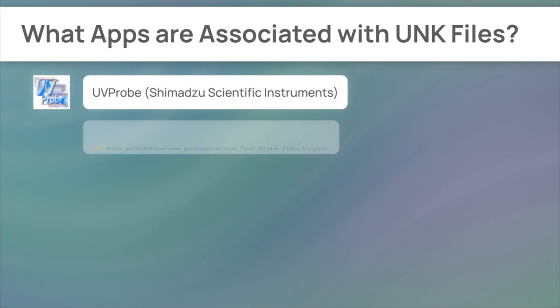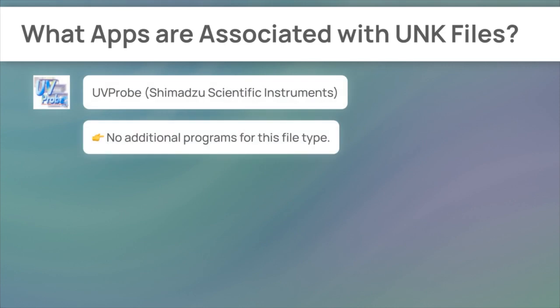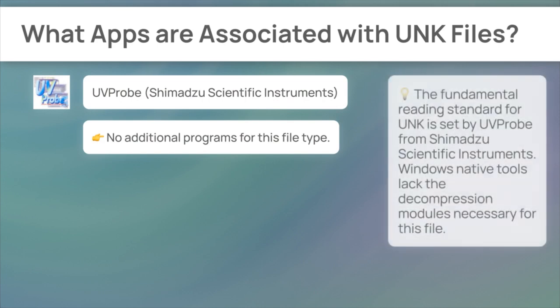The UNK proprietary design mandates association with UVProbe from Shimadzu Scientific Instruments. Windows native tools lack the decompression modules necessary for this file. Windows shows only a simplified view, so deeper interpretation must be done with suitable software.